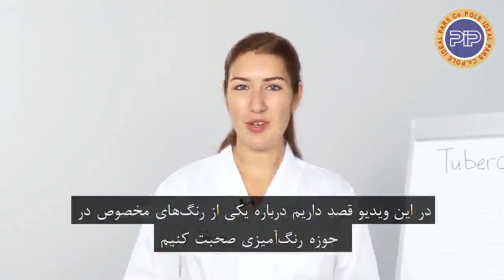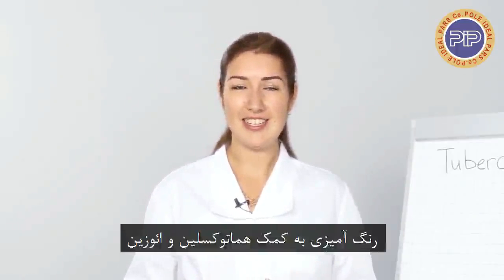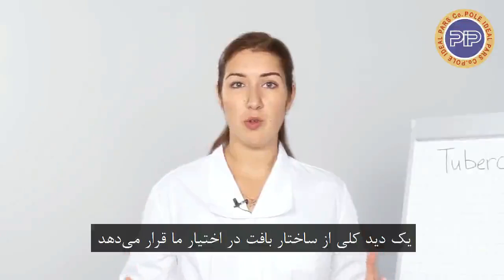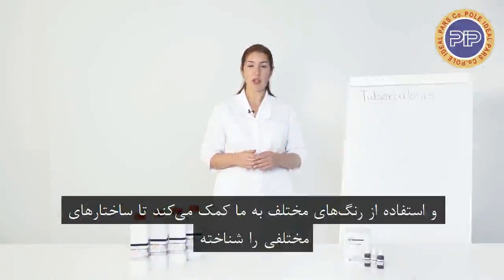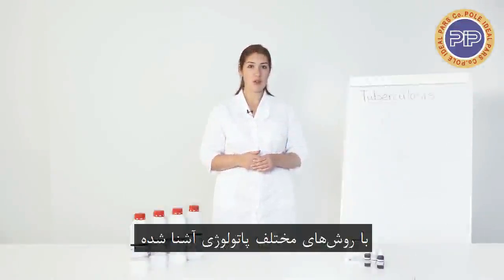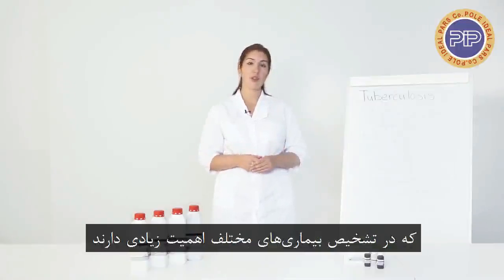Today we will continue talking about special stains in histology. Hematoxylin and eosin staining gives us an overview of the tissue structure, and different special stains can help us to identify different structures, pathological processes in tissue or microorganisms, which is important to diagnose different diseases.